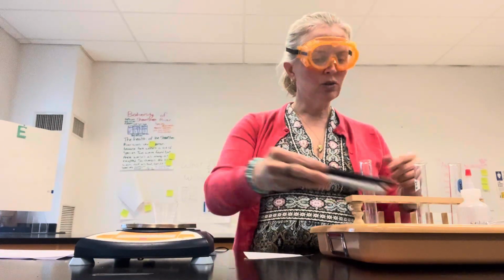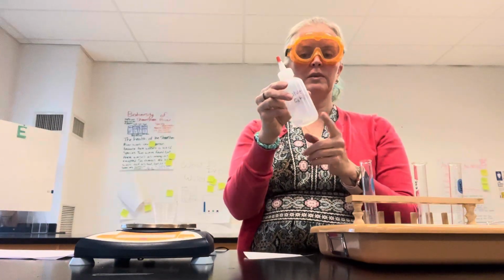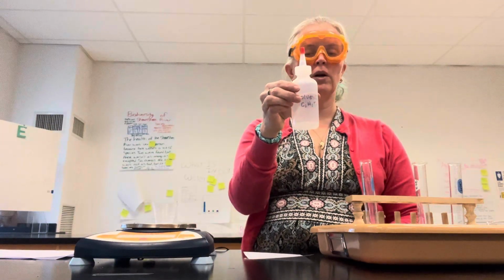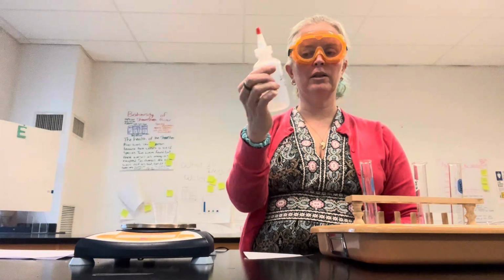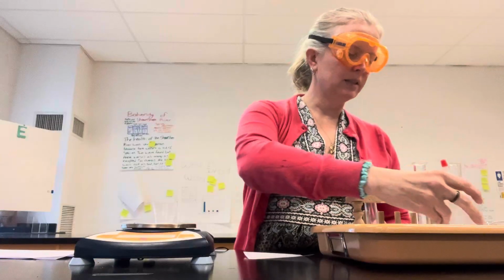In order to do that, you're going to have to wear your safety goggles because we're going to use a solvent. And a solvent is a substance that's able to dissolve another substance. So this contains both water and alcohol, and that's the formula for the alcohol. And alcohol is able to dissolve a lot of other substances. Solvents are often used in cleaning because of their ability to dissolve things.